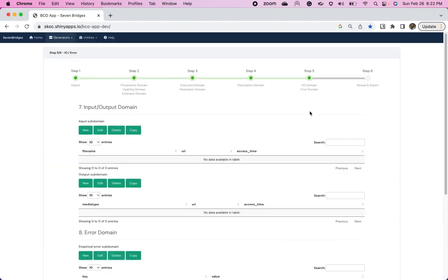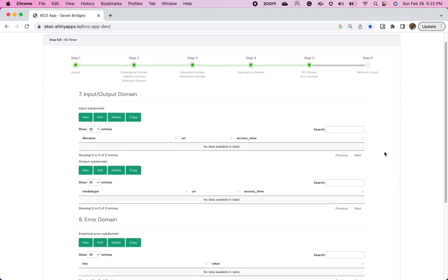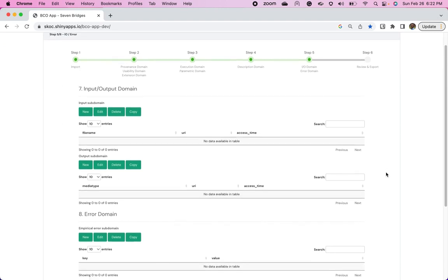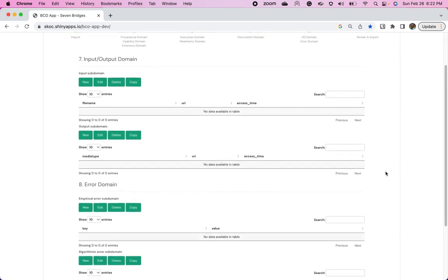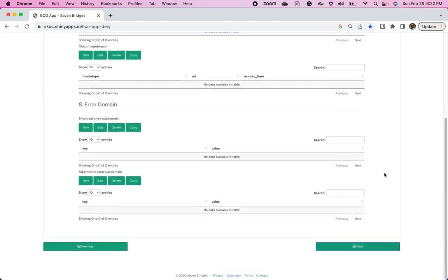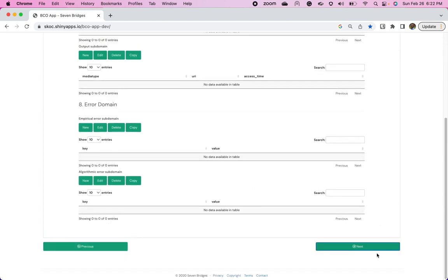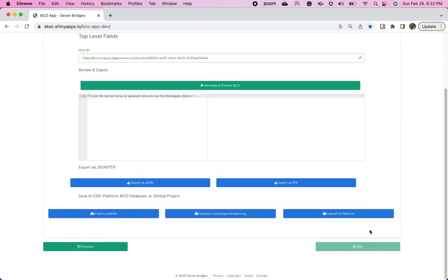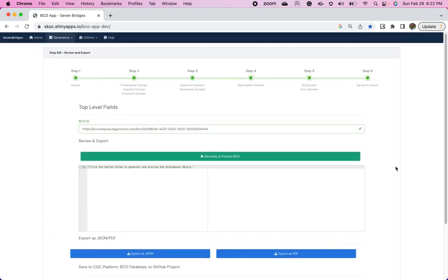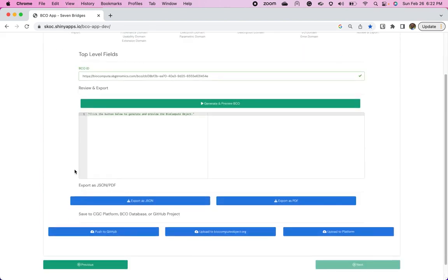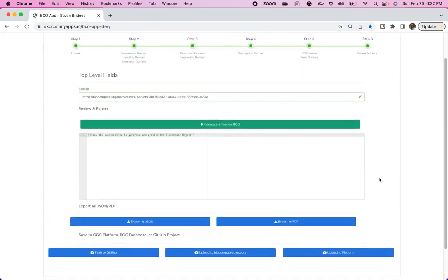And there's an input and output domain. This is where if you set up your inputs and outputs for the app are expected or required, you would see them here. Since this was for a general workshop and more teaching the concepts of RNA-seq, I left this out of that workflow. And finally, you have the last field. And this is where we're going to finally generate and preview our BCO.